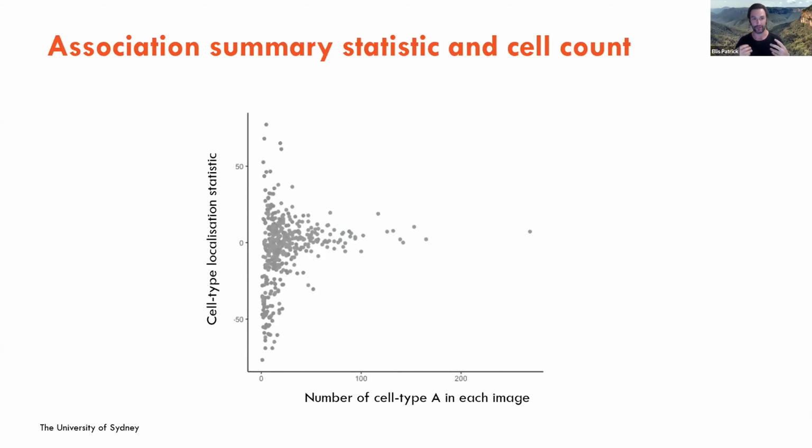And so you've effectively got an average score for each image and you've thrown away other information in that image. Specifically, you've thrown away the information about the size of the image or how many cells are there, which gives you some measure or feeling of the variability or the reliability of your scores.